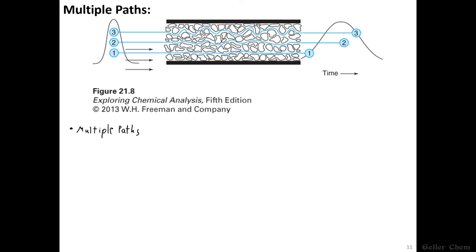Multiple paths occurs in any column packed with particles. Some flow paths are longer than others.